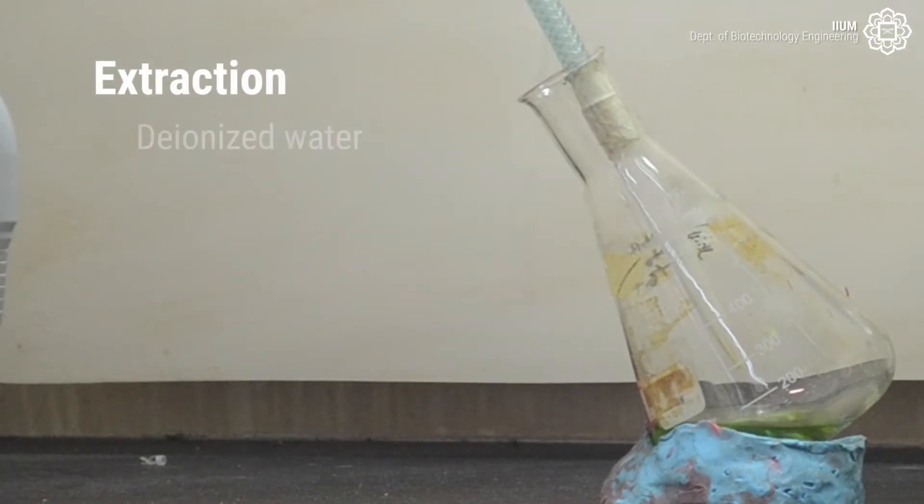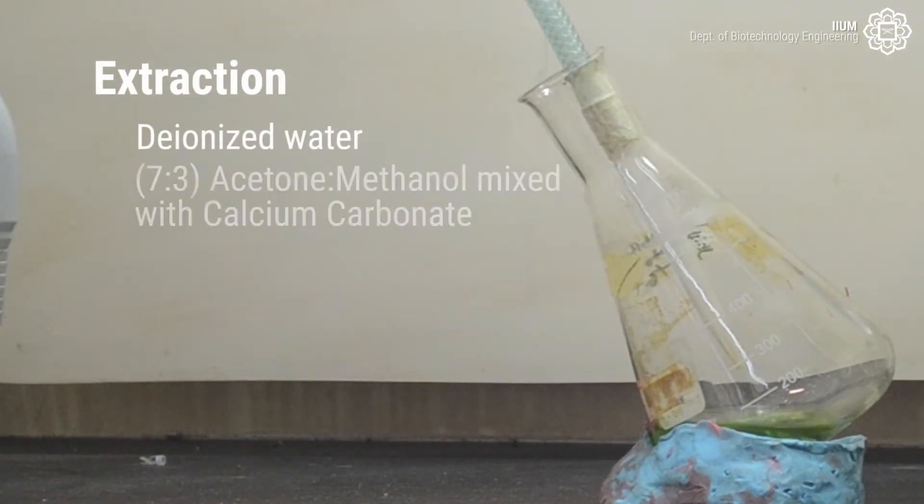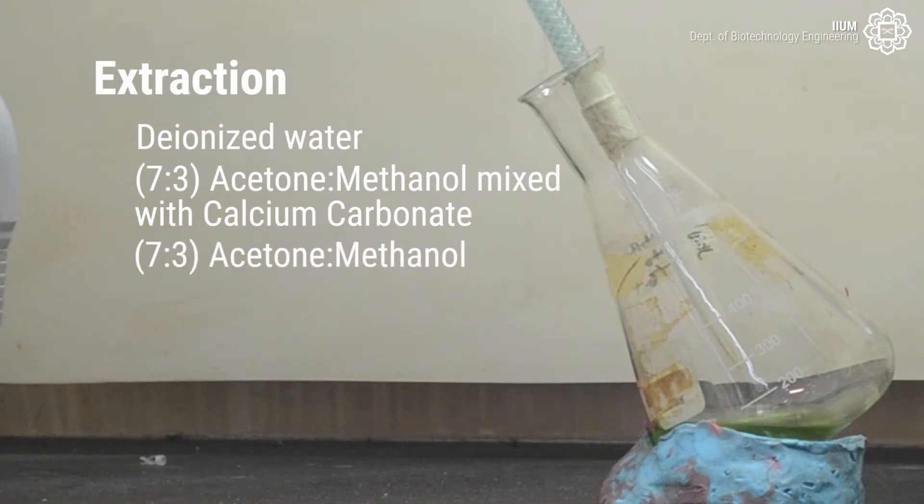The extraction method will need: Deionized Water, Acetone Methanol mixed with calcium carbonate at a 7:3 ratio, Acetone Methanol, Hexane, and Nitrogen Gas.